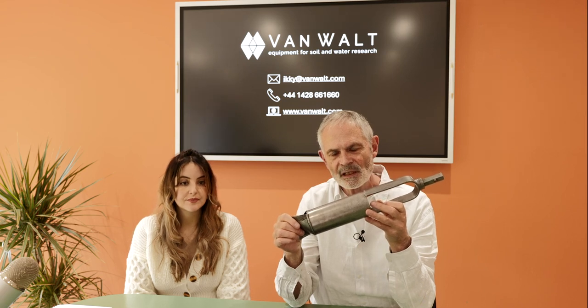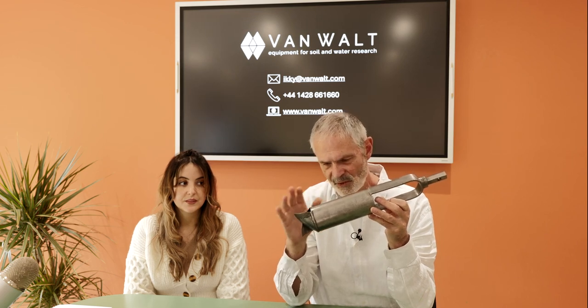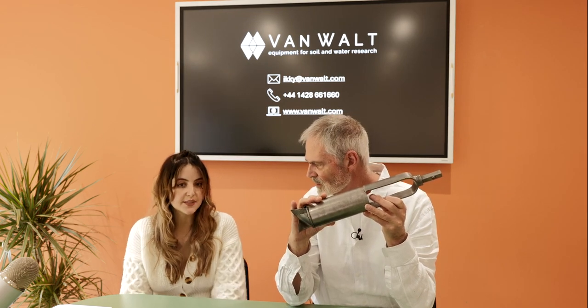Incidentally, what I did forget to say is that most of what we show you today has got some standard sizes. There is no standard for what size you should use. Mostly we use 75mm in diameter. In some cases we go a little bit smaller, so you've got 75, 70 and 50mm. But generally with the augers for the sand and the clays, they are standardised as 70mm diameter. You can get bigger ones, of course.